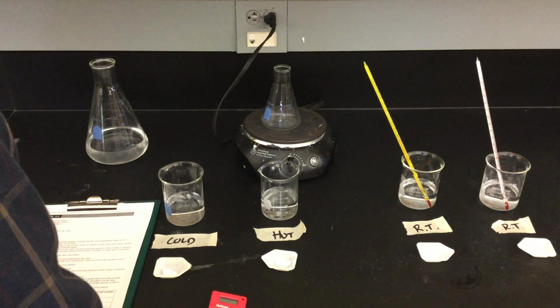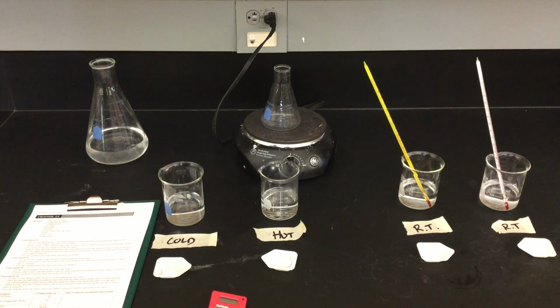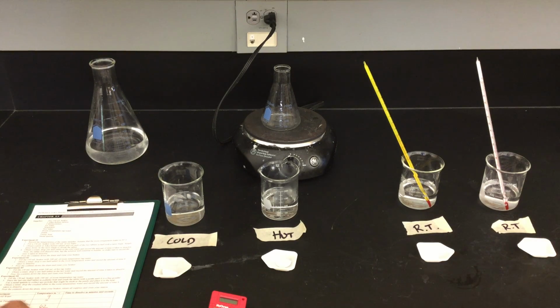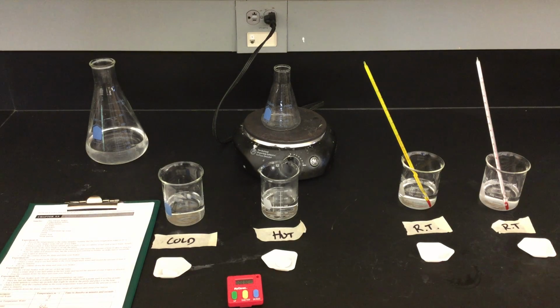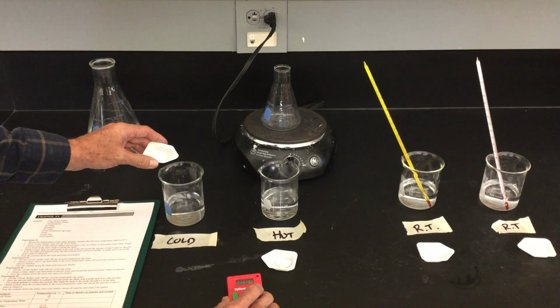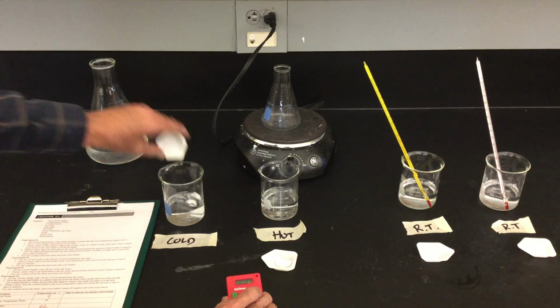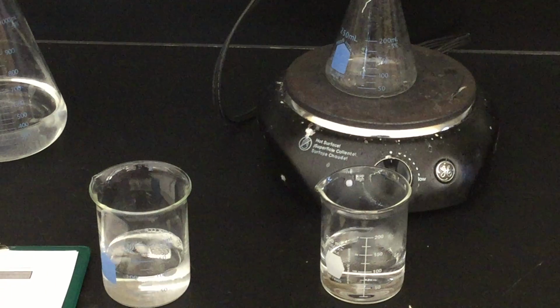We have a beaker filled with ice. We have Alka-Seltzers that have been cut, the Alka-Seltzers that have been cut in smaller pieces, in half. And then we're going to be dropping the Alka-Seltzer in. We're going to be recording the time for these things. So I have a timer right here. We're just going to record the amount of time that it takes for this reaction to take place. So in goes the cold. Let's see, 3, 2, 1, go. Okay, Alka-Seltzer goes in, and it's beginning to bubble.